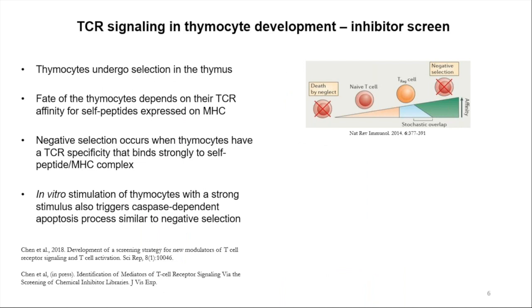Thank you, Jo. I hope I'm audible. Okay. So, good morning. I'm Elijah, and I'll be introducing an assay that we have developed in our lab for the identification of modulators of T cell signaling and T cell activation.